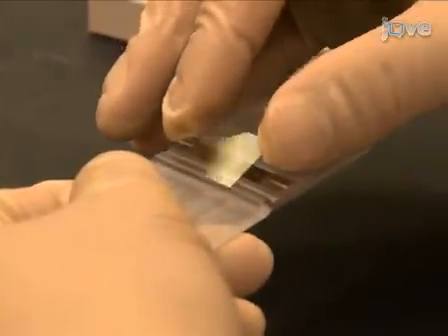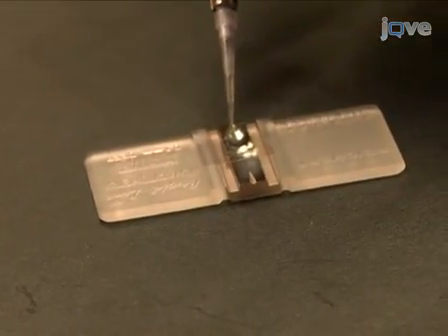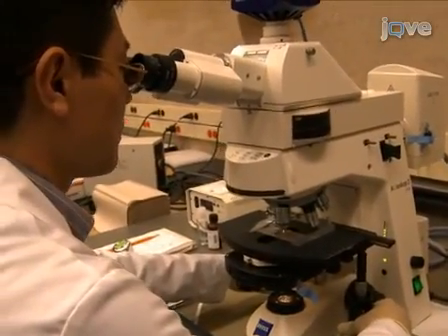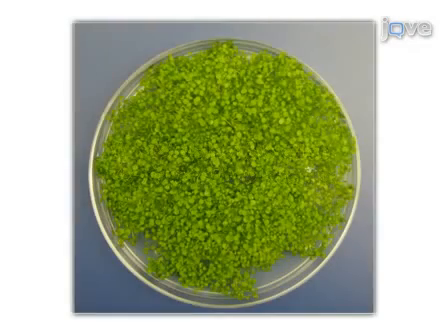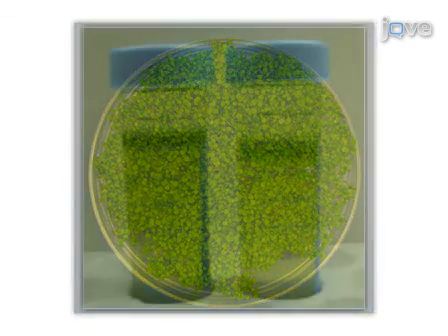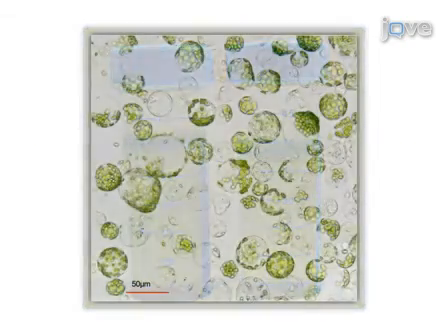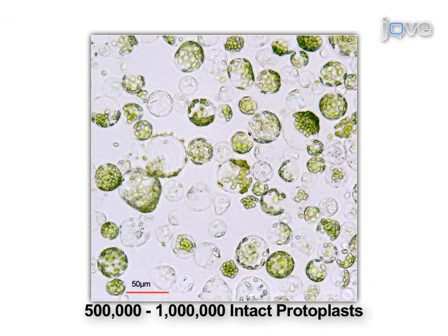Finally, evaluate the protoplast yield by cell counting with a hemocytometer under the microscope. The culturing procedure described here yields healthy Arabidopsis seedlings suitable for isolating protoplasts. After digestion and separation on a density gradient, harvesting 1 gram of fresh seedlings typically yields 5 to 10 times 10 to the 6th intact protoplasts.